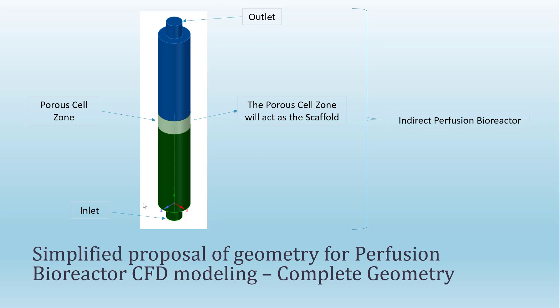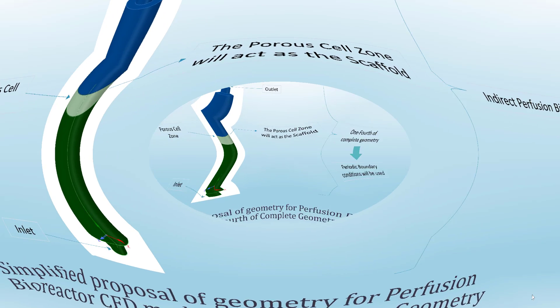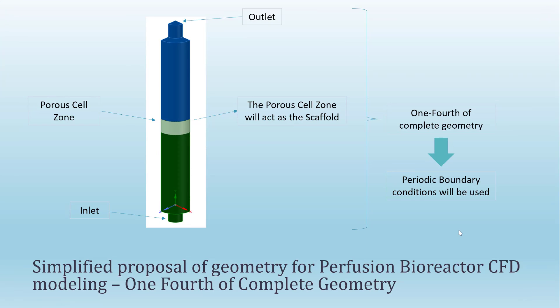The porous cell zone is the one that will act as the scaffold of the bioreactor. You can see that in this case I am showing you the whole geometry, the complete geometry. The other option is to use only one-fourth of the geometry.